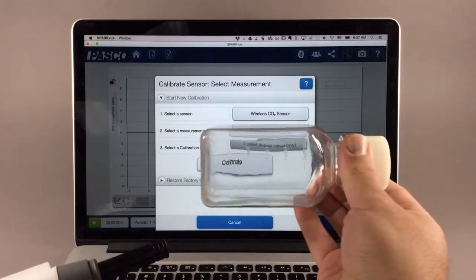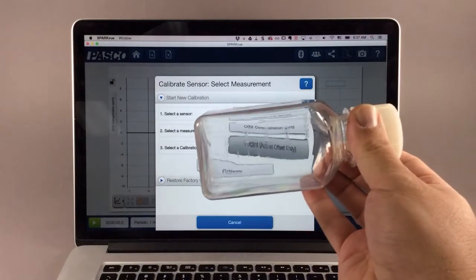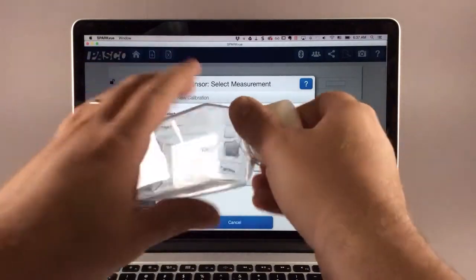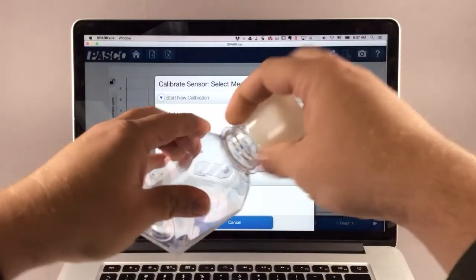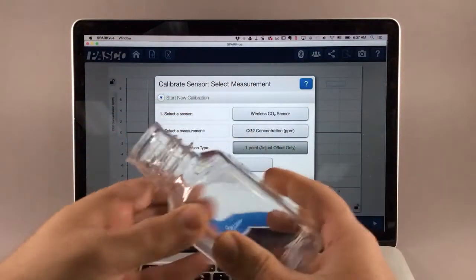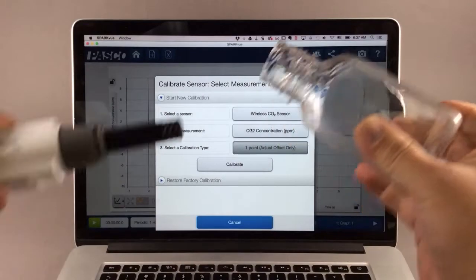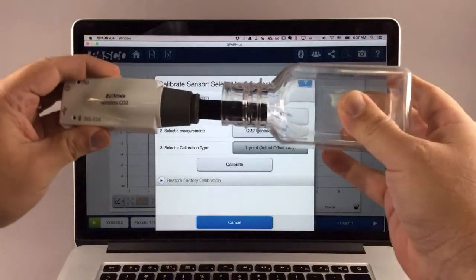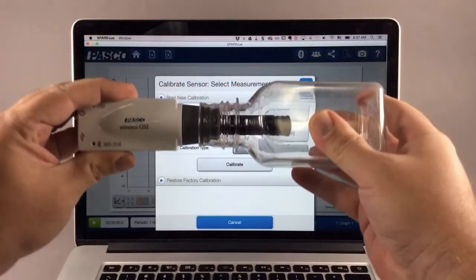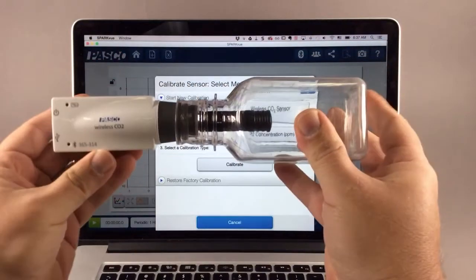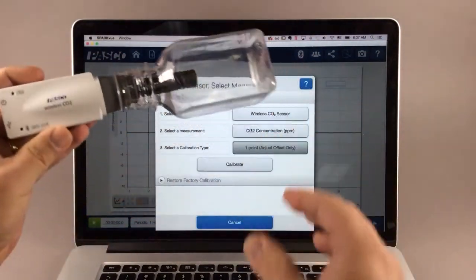Now you need a sample of fresh air, such as that taken outdoors. Simply place the sensor into that sample of fresh air. Here I'm using the bottle that was provided with the sensor.